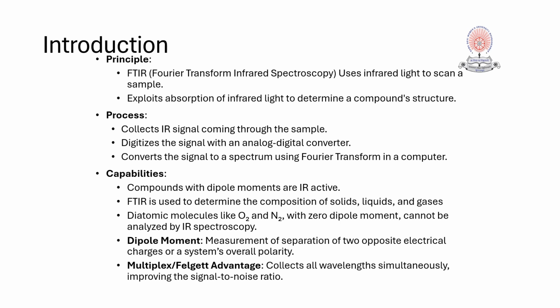The molecules that can be analyzed may be solid, liquid, gas, but the condition is that the molecule must have some polarity or dipole moment, because after absorbing the IR light, the dipole moment changes, and that change finally generates the spectrum. The molecules which have zero dipole moment like oxygen, nitrogen cannot be analyzed by this particular spectroscopic technique.